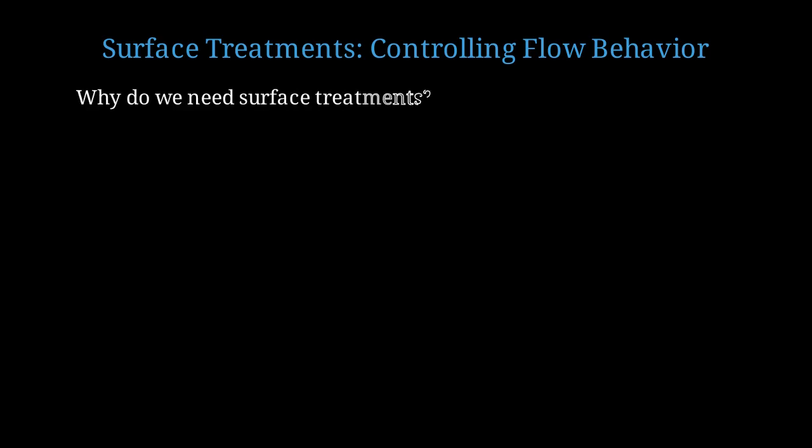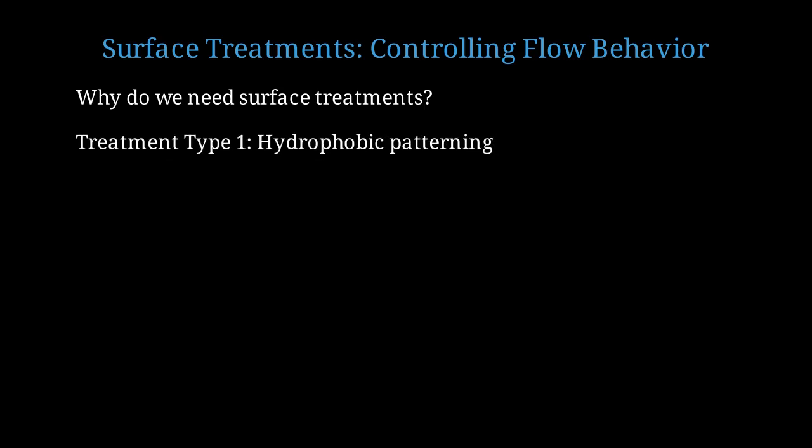Why do we need to modify the paper surface? The answer lies in controlling both fluid routing and biochemical interactions. Hydrophobic patterning, as we discussed, creates barriers that confine fluid to specific paths. This is the foundation of channel definition.